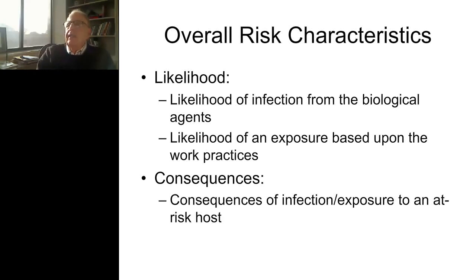Likelihood then is the likelihood of acquiring an infection after an exposure has occurred. And it's based on both the biological agents that are involved and the work practices, the work performed in that laboratory. The consequences are, will the person who's exposed acquire an infection, or will they need to take post-exposure antibiotics, or maybe there's a post-exposure vaccination that might be involved, for any at-risk individuals who are exposed. So we have likelihood and consequences that we have to consider in the risk assessment process.